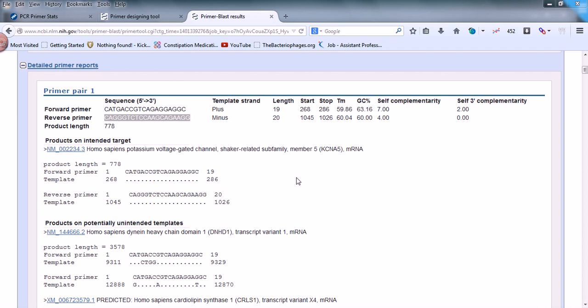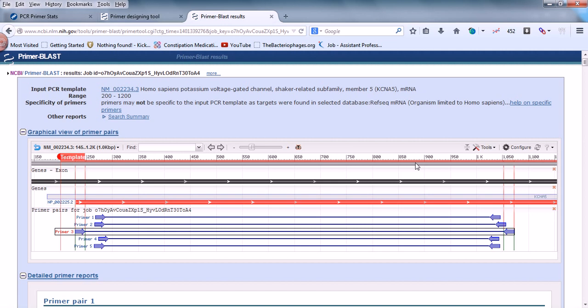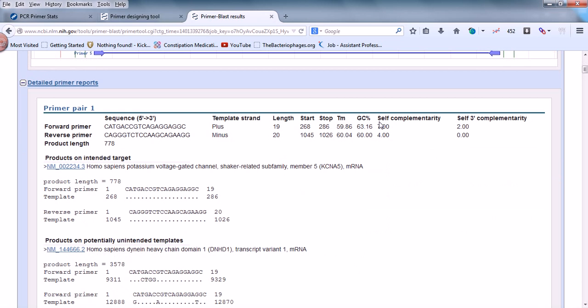Once you design the primers using NCBI, we selected five different pairs because we put the value as five. So it tells us five different primer pairs exactly depending upon our choice. Once we find five different primers, we need to find out which among these five pairs is going to be a perfect pair for us.